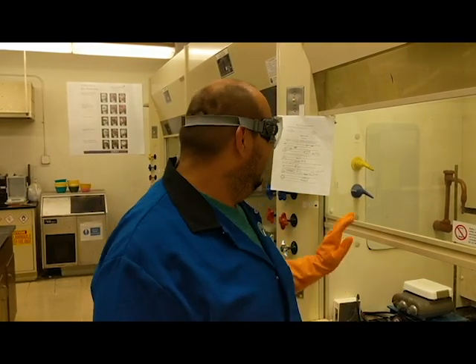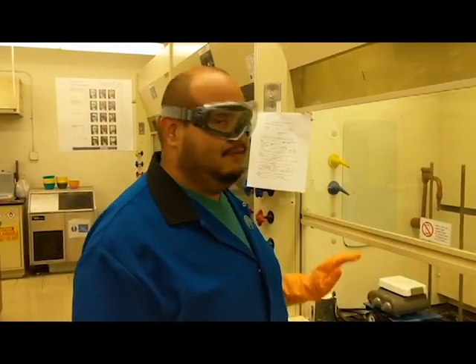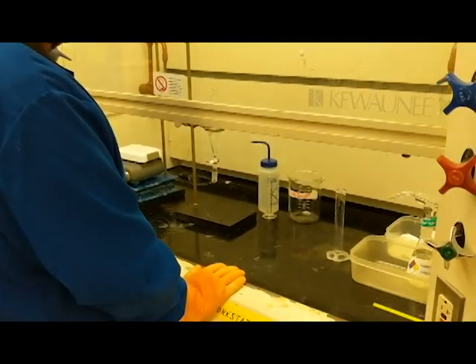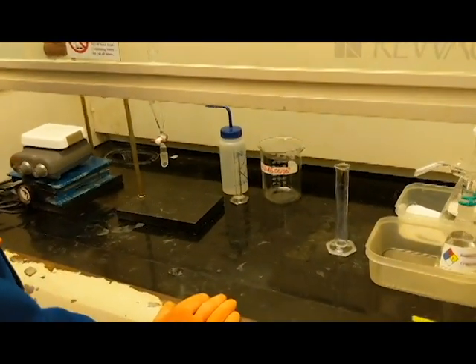Hello everybody, my name is Professor Diaz, and today we're going to do our first online video demonstration on the preparation of 2-chloro-2-methylbutane. In front of me, I have all of the solutions and the glassware that I'm going to be working with today.